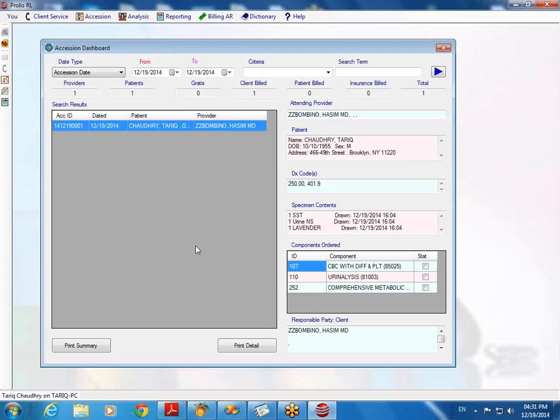Chia brought up a good point. Is there a limit on how many users could work with the system simultaneously? Like I said, users are unlimited. You could create any number of users in the system. Sorry, I should rephrase. How many seats could work on the system simultaneously? For example, if 2 or 3 people in the lab want to accession at the same time, is that feasible, or can only one person at a time? No, that's a multiple user system. You could have 50 people accessing at the same time, provided you have 50 seats.